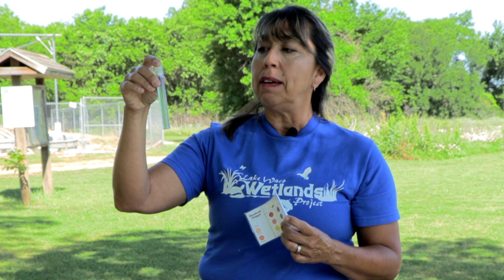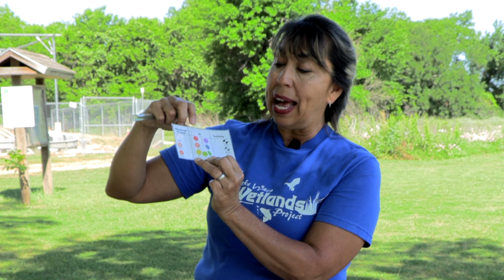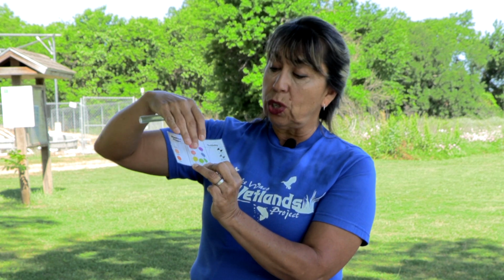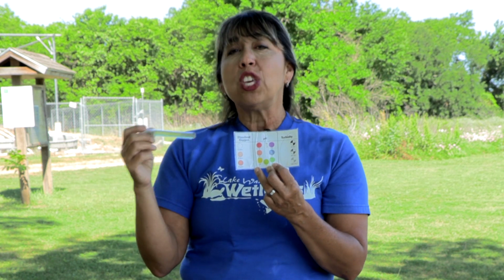Next, what we're going to do is test for pH. pH just tells us how acidic, neutral, or alkaline your water is. And that's very important in a healthy wetland system or a pond system, river system, lake system, because that determines how healthy your water is and what type of organisms, what kind of vegetation will actually live in this particular area. Like I said, it's all color coded. In our particular case, it only goes from 4 to 10 with the different color scheme that it has on there. So anything from a 0 to a 6 is considered acidic. Anything from 14 to about an 8 is alkaline. And in any case, whether you're drinking your water, flushing your toilet, or taking a bath, you want that water to be at a 7.